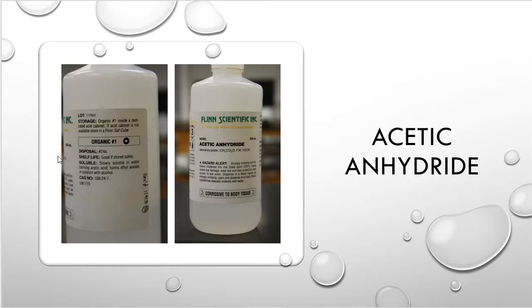So first, I need acetic anhydride. That's what the directions actually tell me to do. It tells me to take acetic anhydride and so on, measure out how many millimoles or how many mLs.